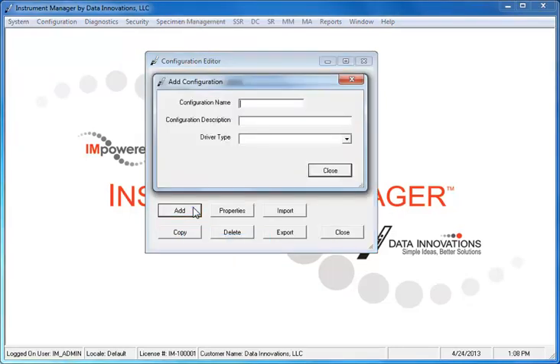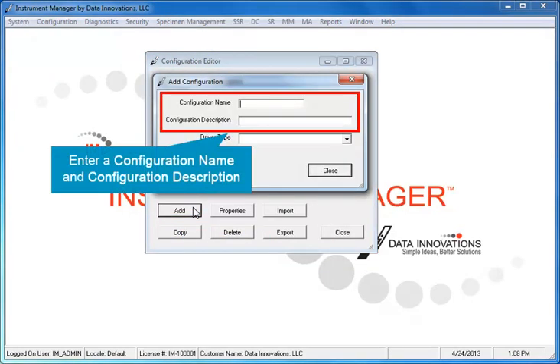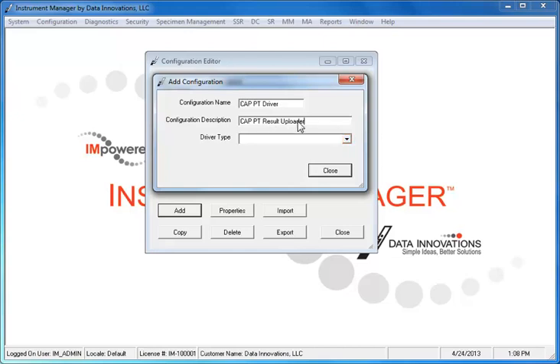In the Add Configuration dialog, type a name and description for the configuration. For example, you might enter CAP PT driver for the name and CAP PT result uploader for the description. Next, select CAP proficiency testing from the Driver Type drop-down.